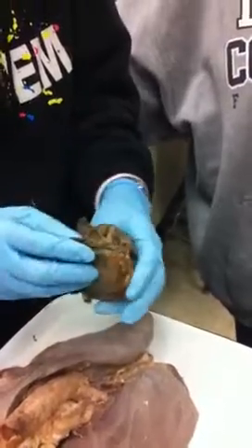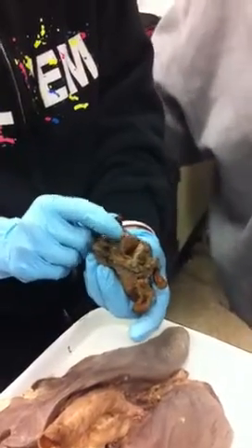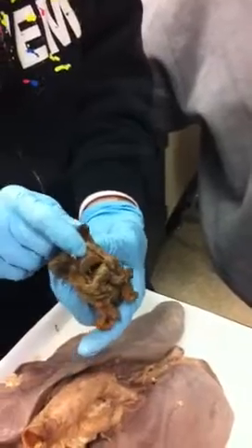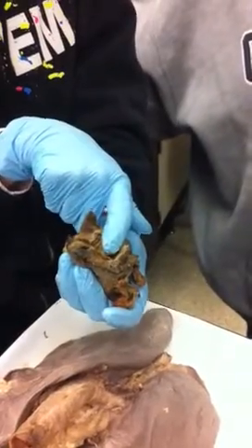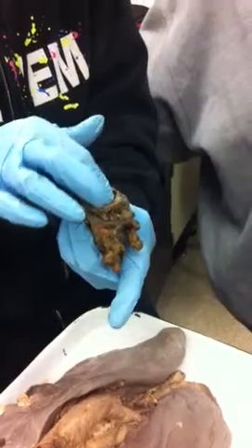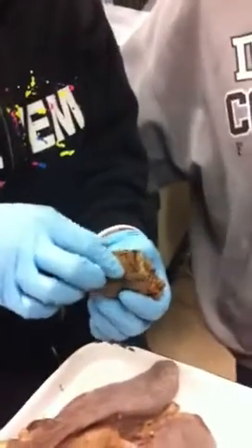Okay. So this right here is the opening to the trachea. This is the epiglottis. This leaf-shaped thing right here, that's epiglottis. So that when the sheep swallows, that folds like that, blocks off that trachea. So this is the front. So it's going to come forward, it's going to block off the trachea, and it's going to force the food back down the esophagus, which has been taken off here. These right here, this is part of the hyoid bone, sticking up here.